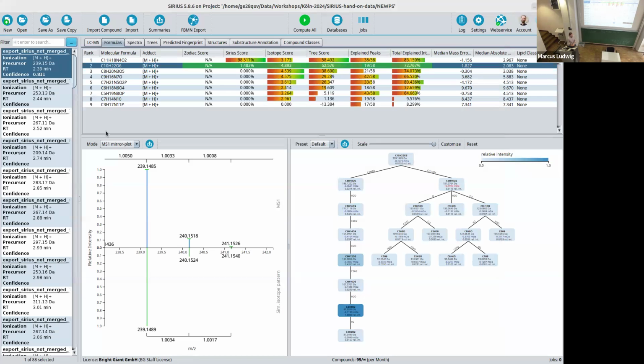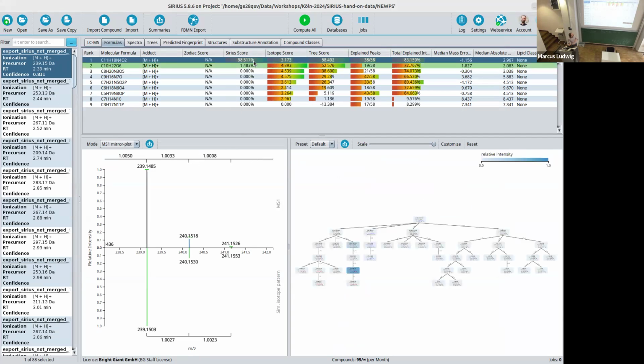So okay, now it looks much nicer. Yeah, so basically that's why I was looking for such a feature, because now we have some better scores in here. Because for the first one, basically here were all zeros in there.